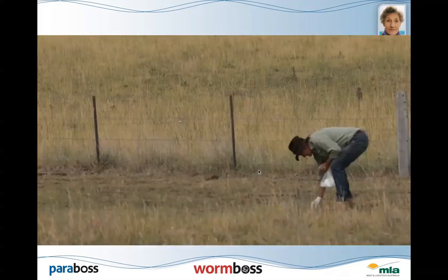Just follow along in a bit of a grid pattern where the sheep were until you've filled up each of your containers, or if you're doing a bulk sample, you'll be collecting maybe 1 to 3 pellets depending on the size of the sheep, just an even amount from each pile, until you've got about half to 1 cup of sample there.